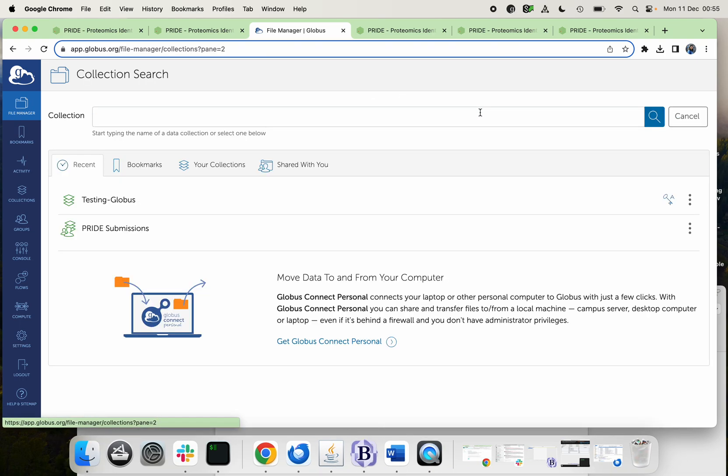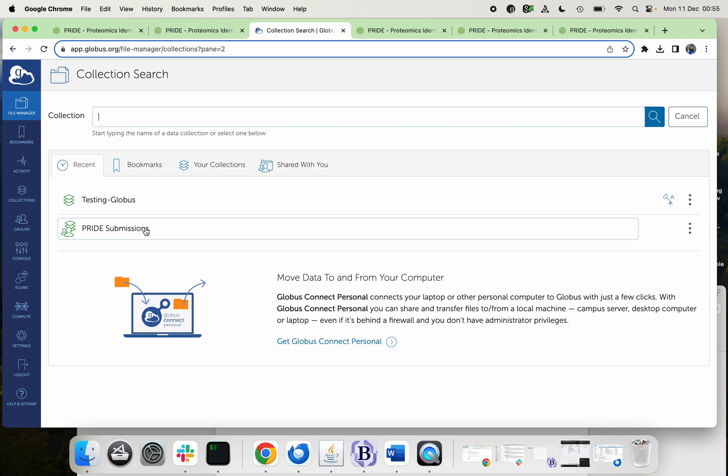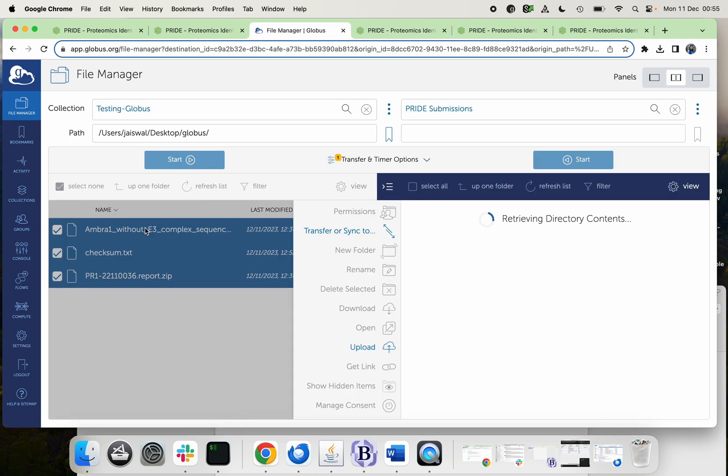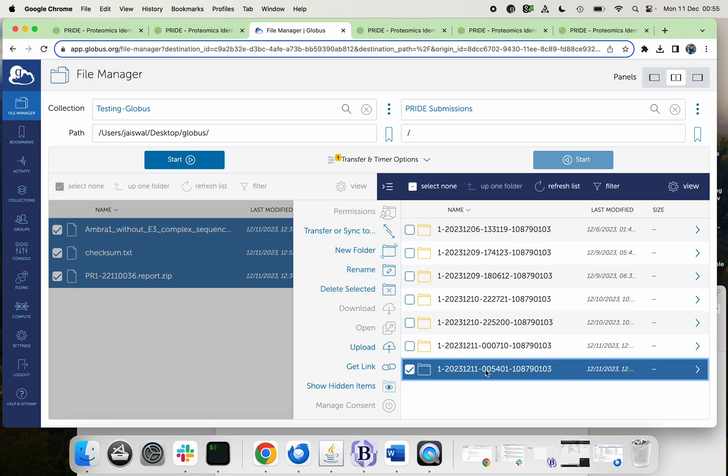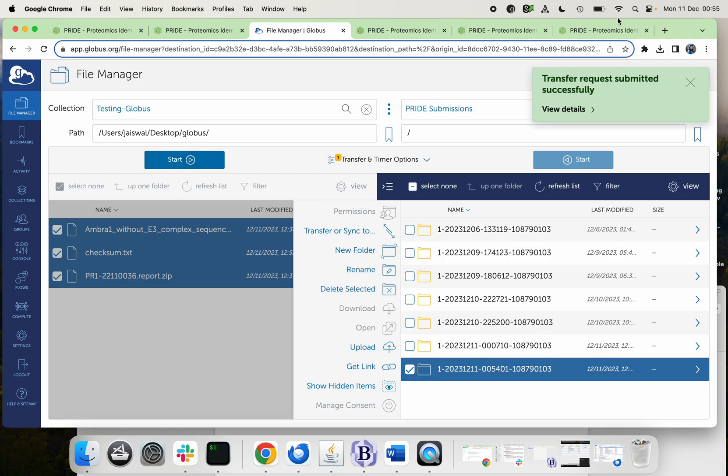Then come here, go to the next window and select where you want to upload your files. So you have to select the PRIDE submission collection. Then it will appear your reference ticket here. Select that and just start the process, and it will tell you that transfer request has been submitted, but it hasn't been submitted yet.